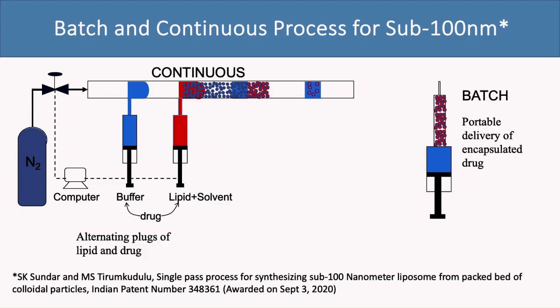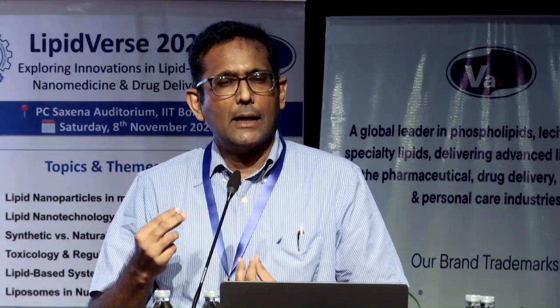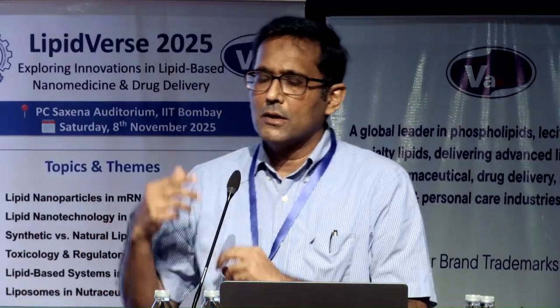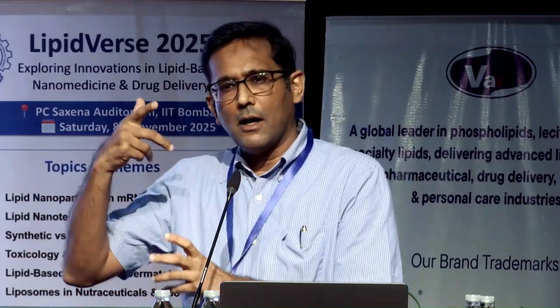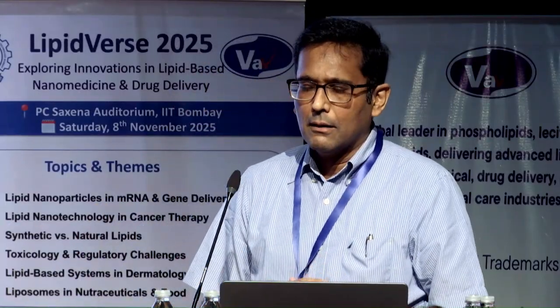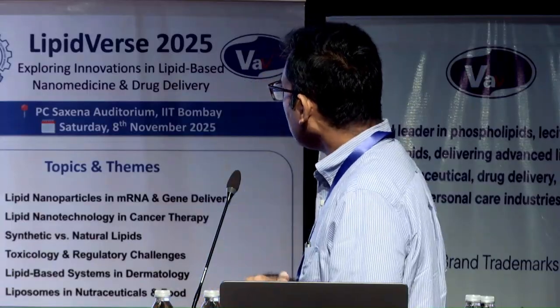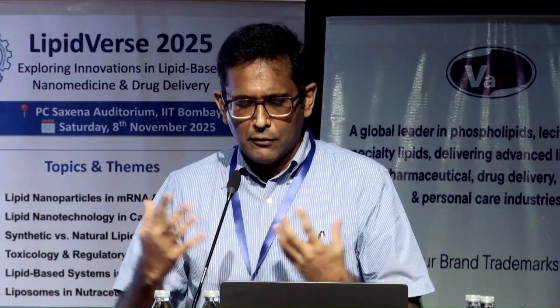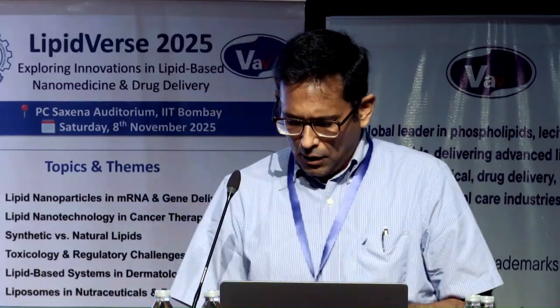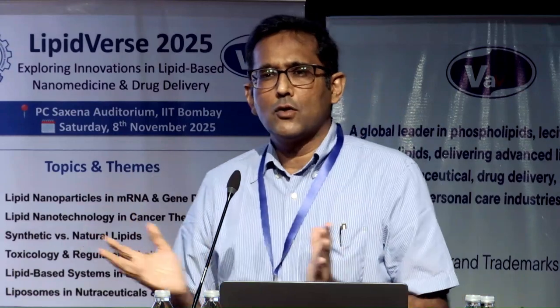And we also thought that, of course, that maybe this can also be converted into a very small compact device where you can have the lipid pre-loaded into the packing itself. And then all one has to do, the user has to do, if this idea really works, is to just take a liquid with the drug and push it through so that at the other end what you get would be the nice encapsulated drug. So that was the idea. Of course, we need to optimize this packing and so on so that the pressures that you apply are not very high. So this is what Sundar had done.